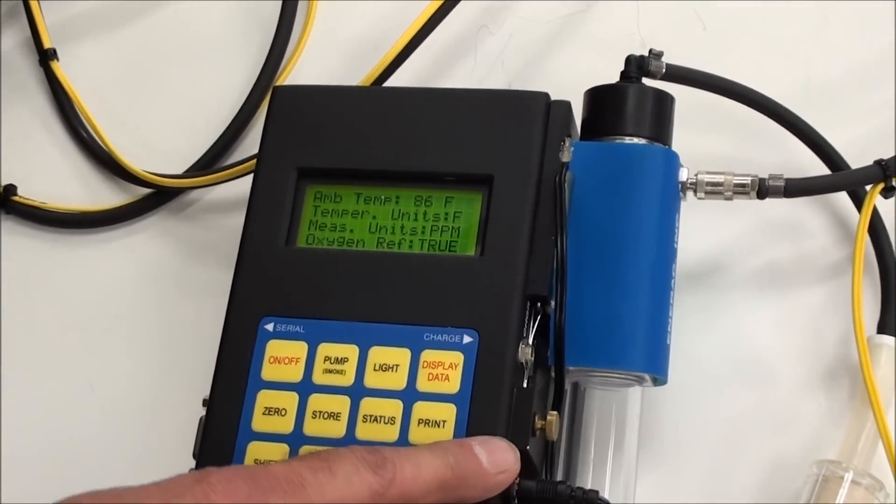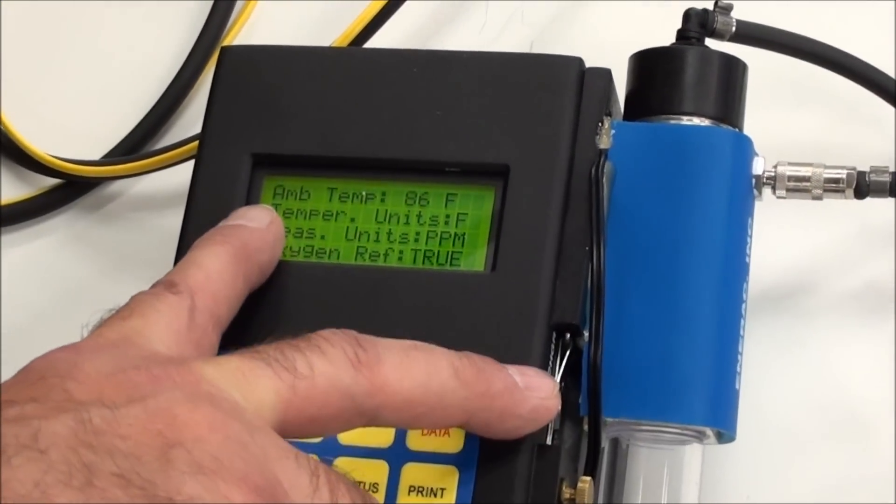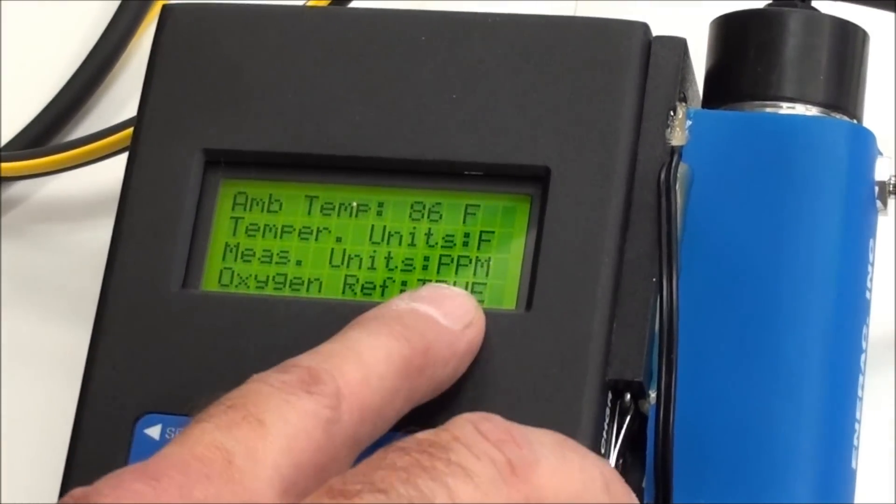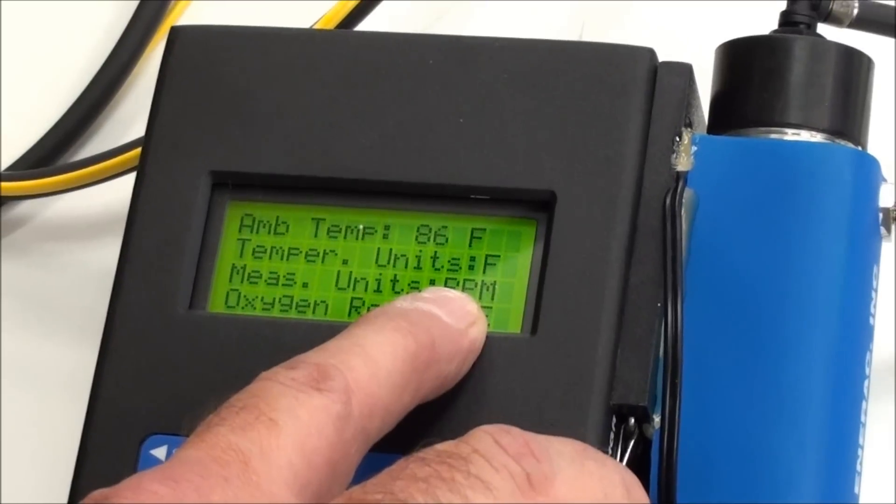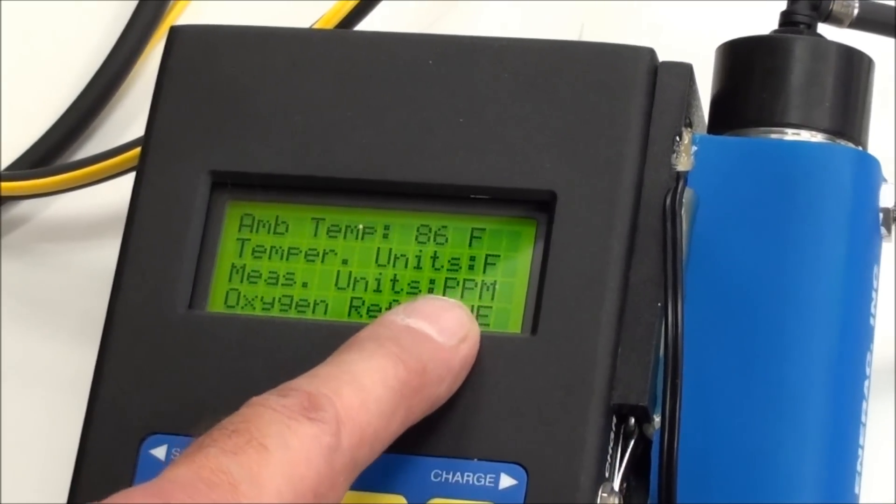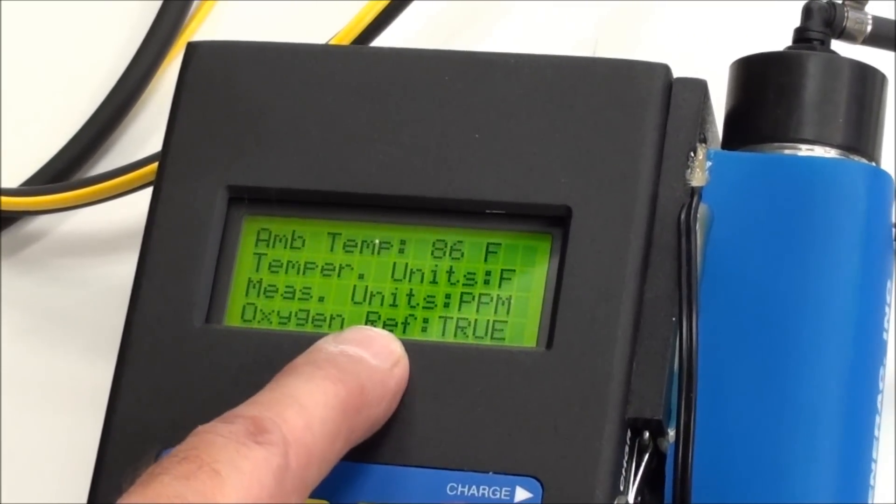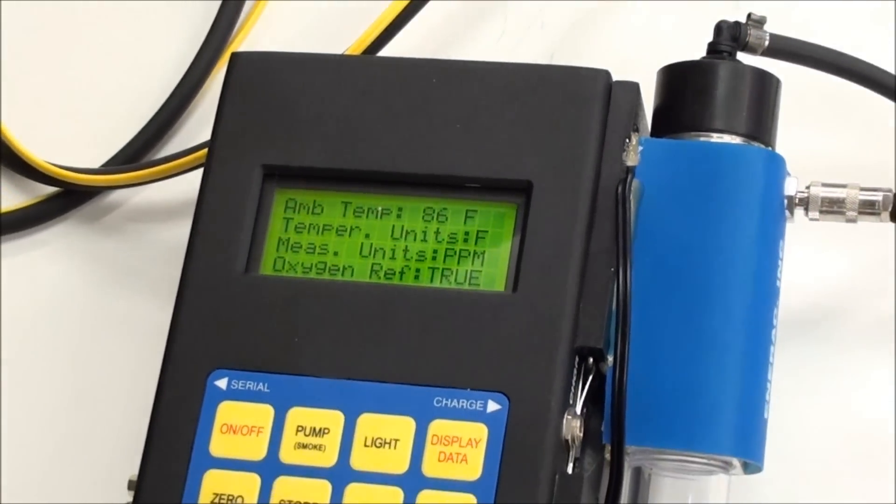The next screen is the ambient temperature. The temperature units in Fahrenheit or centigrade. Measurement units, you have several options on that. You can do PPM, grams per brake horsepower hour, pounds per million BTUs. Then is the oxygen reference. If you need that, you can go in and you can set that. I'll show you that in the menus.